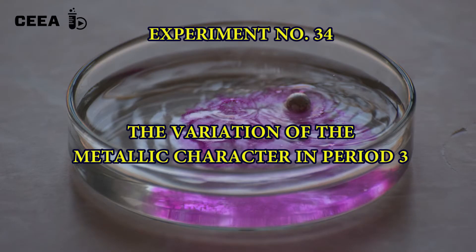The variation of the metallic character in period 3. Three metals are reacted with water in order to determine the variation of the metallic character in period 3: sodium, magnesium, and aluminium.